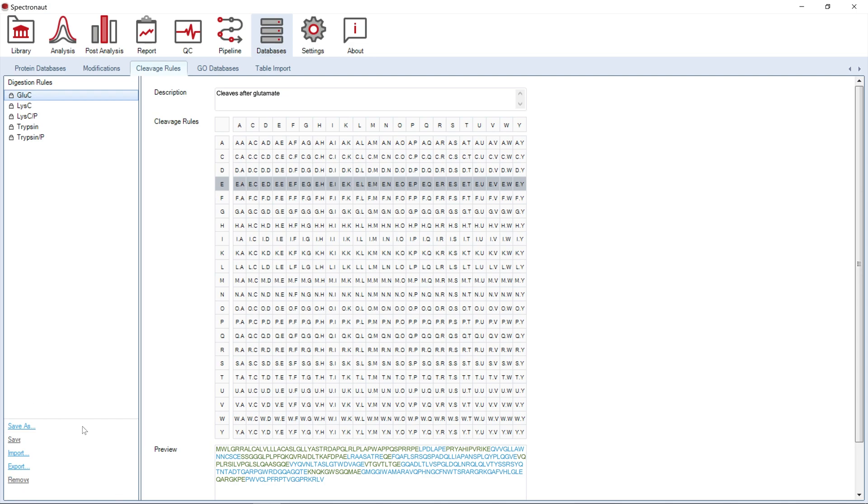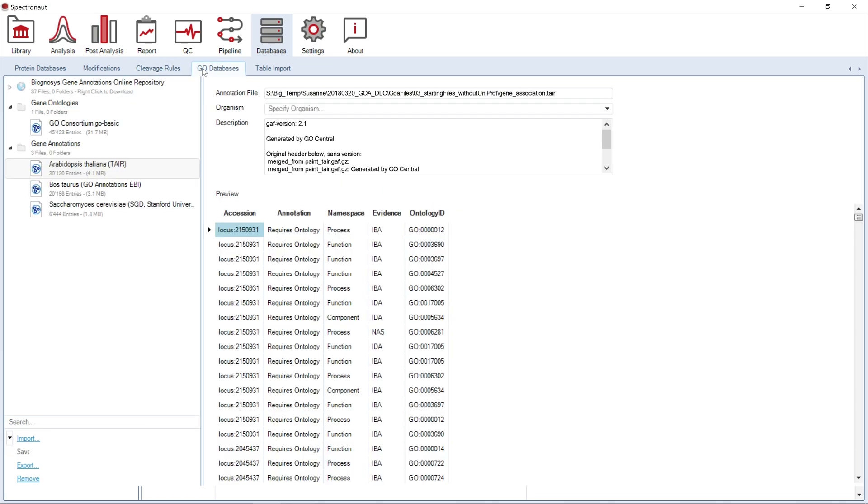The next database tab is linked to gene ontology. Information included here will be used to further annotate your data. This annotation will be used for calculating term enrichment and give further biological insight into the differential abundance results.